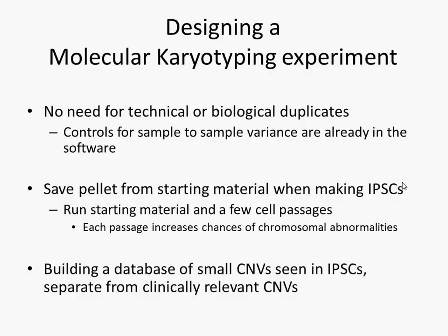So how do you design a molecular karyotyping experiment? There is no need for technical or biological replicates, again, because you estimate deletions. These are very clear signals. And in terms of normalization, the controls for sample-to-sample variance are already in the software. This is what you use to calculate the log R ratio.